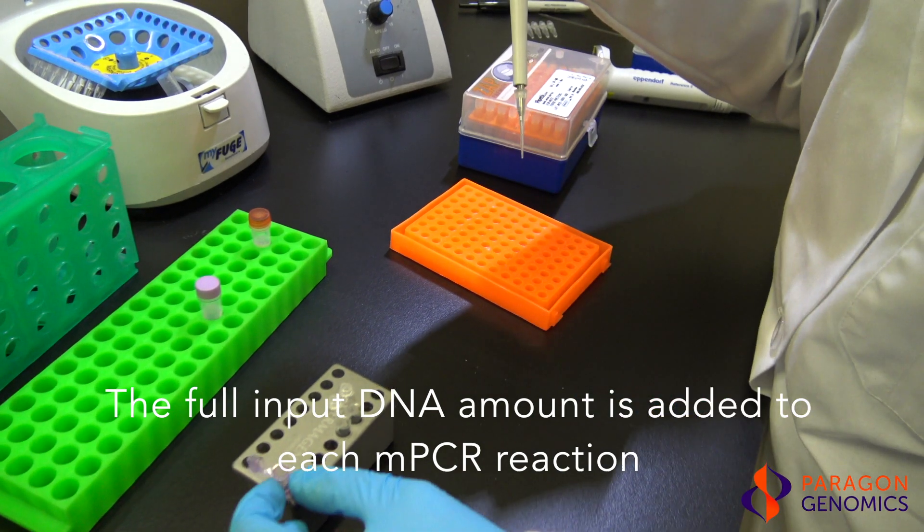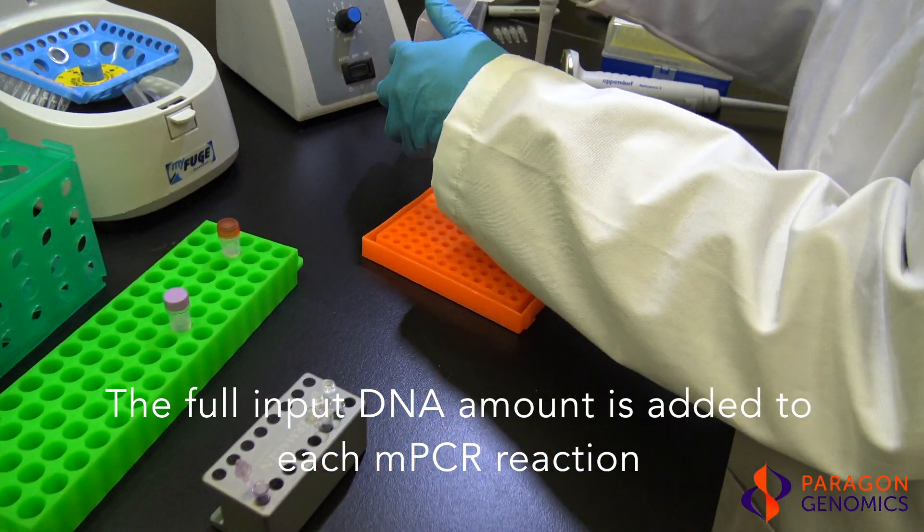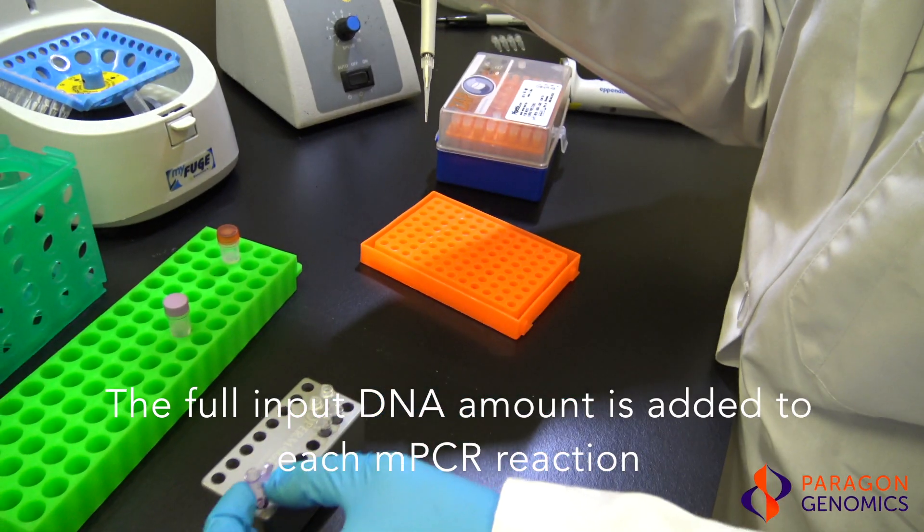The full input DNA amount is added to both reactions. This means that a two pool panel requires two times the total amount of input DNA as a single pool panel.